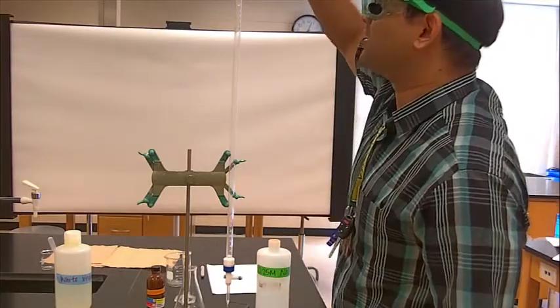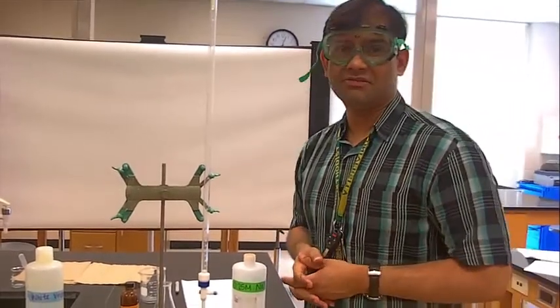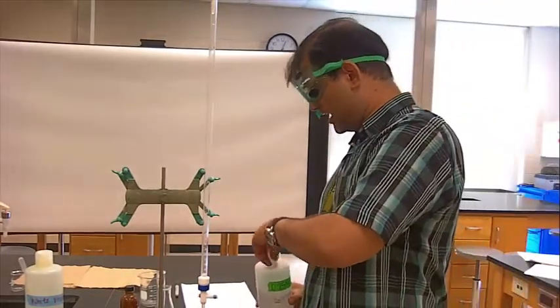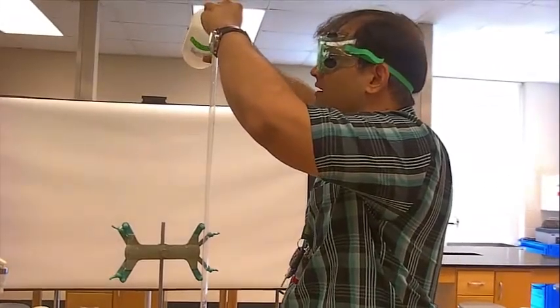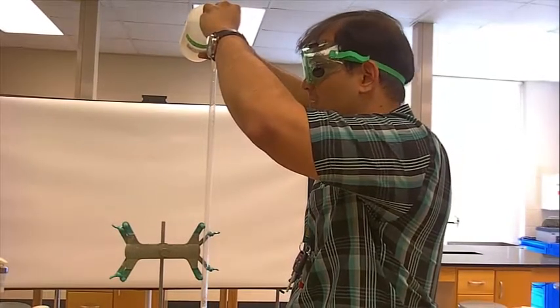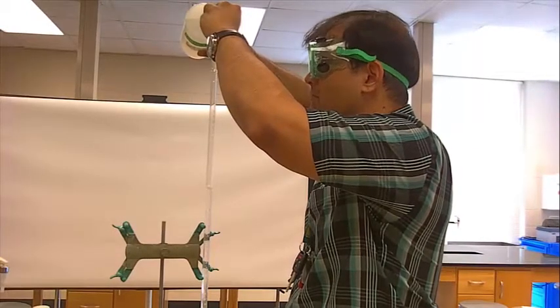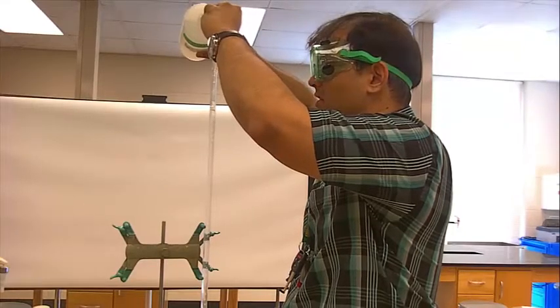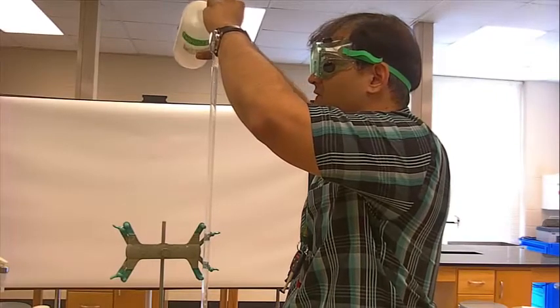Now, a good trick is, I like to fill it all the way up to 0, or in this case, because you have to read it to 2 decimal places, 0.00. So let's just go ahead and do that here. Okay, so if you have a very long funnel, you may want to just be careful. Don't let it overflow. All right, I'm just going to go a little bit above 0.